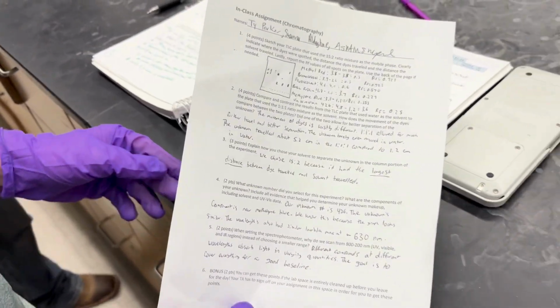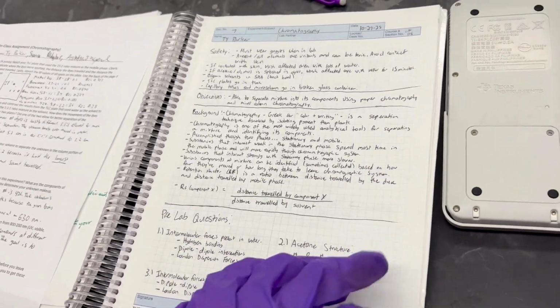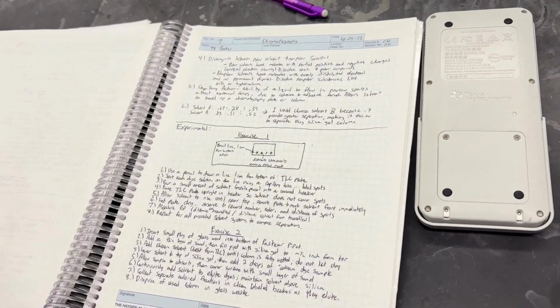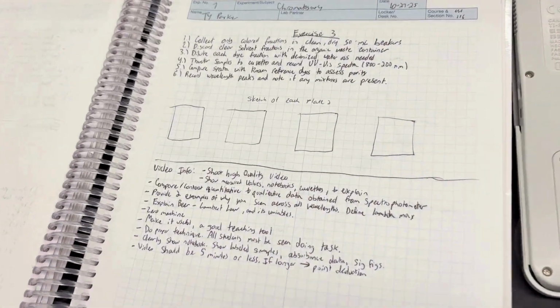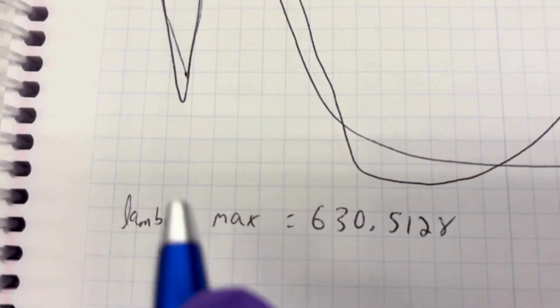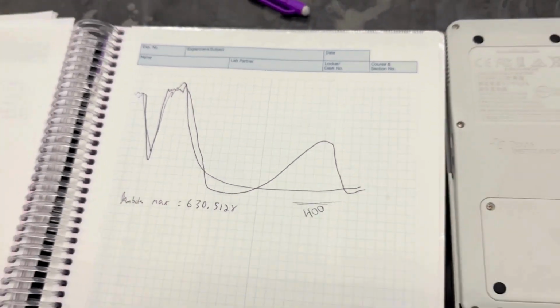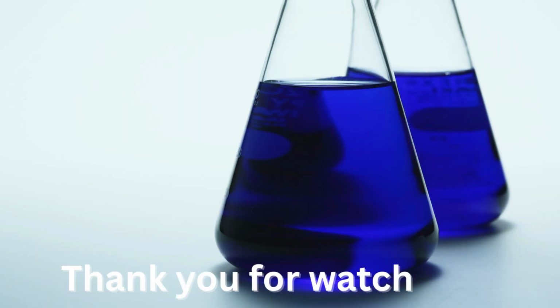Here's our lab notebook and our worksheet. In our notebook, all samples are labeled clearly. We recorded absorbance data for all samples. Data and calculations correspond to the volumes shown previously in the video. We wanted to make sure our notebook is easy to follow for anyone wanting to review the experiment later.